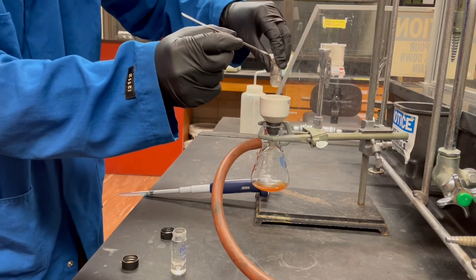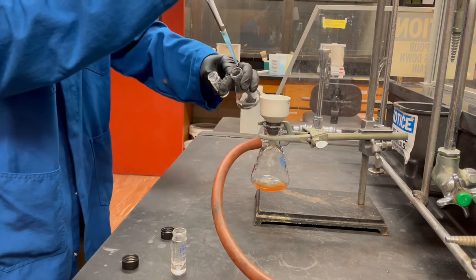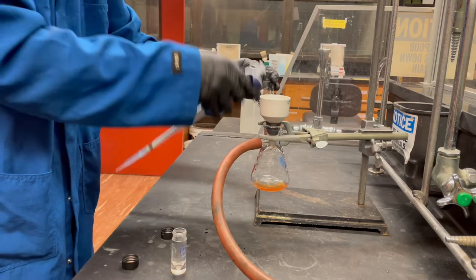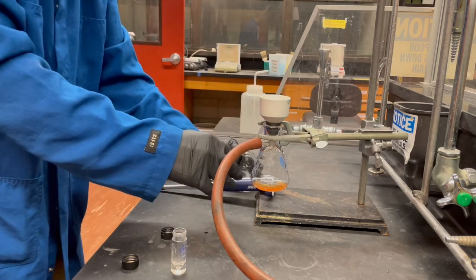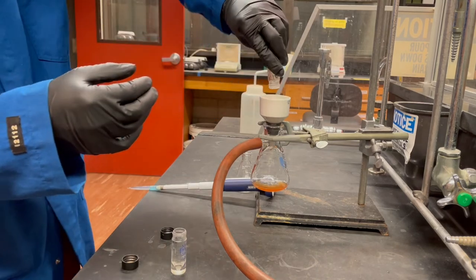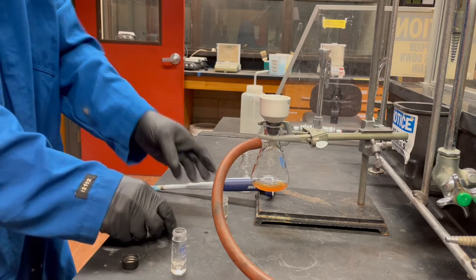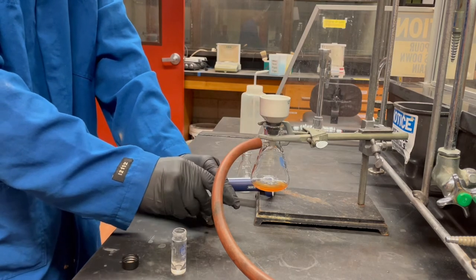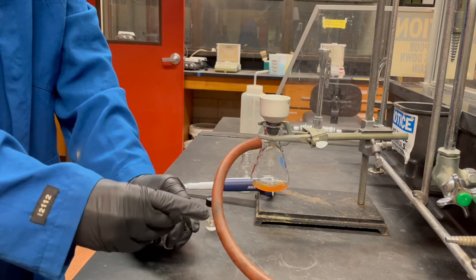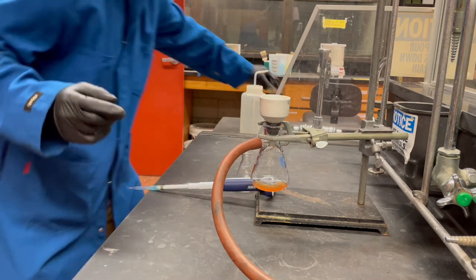This one like a little more TLC, I'm not really sure, we'll see what it looks like. But also got to remember that the filtrate, the stuff down here in the filter flask, is going to have a little bit of triphenylphosphine oxide, which is the toxicity of our city. Got a little something going on that we don't really want to breathe in or breathe out.